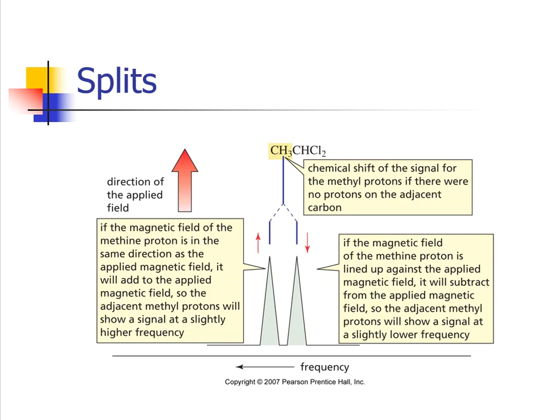So what you're seeing on the screen right now is just a focus on this CH3 group, and these protons all are equivalent, right? We know that now from all of these other previous lecture videos. And these equivalent hydrogens, there's 3 of them, so that is going to cause a signal. Where that signal happens, I don't really care, and I don't think that you want to care either. But what we're focused on here is the idea of splitting and why it is occurring.